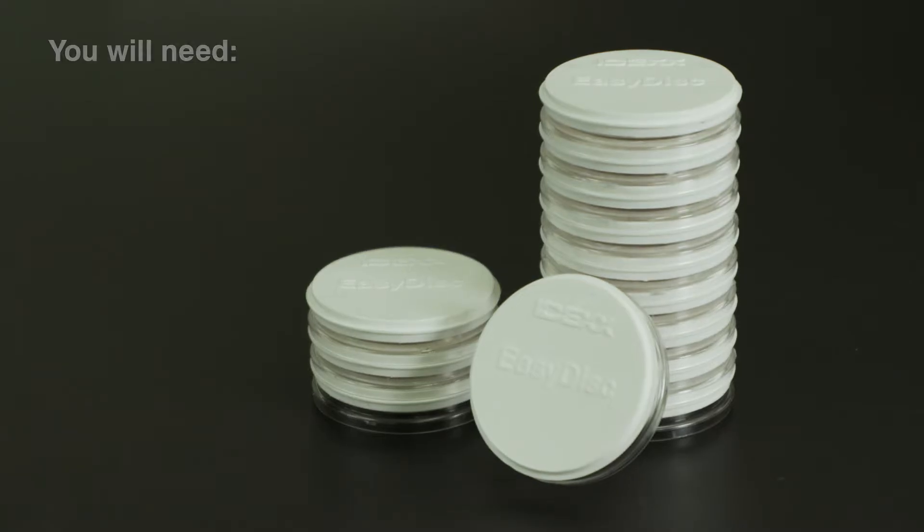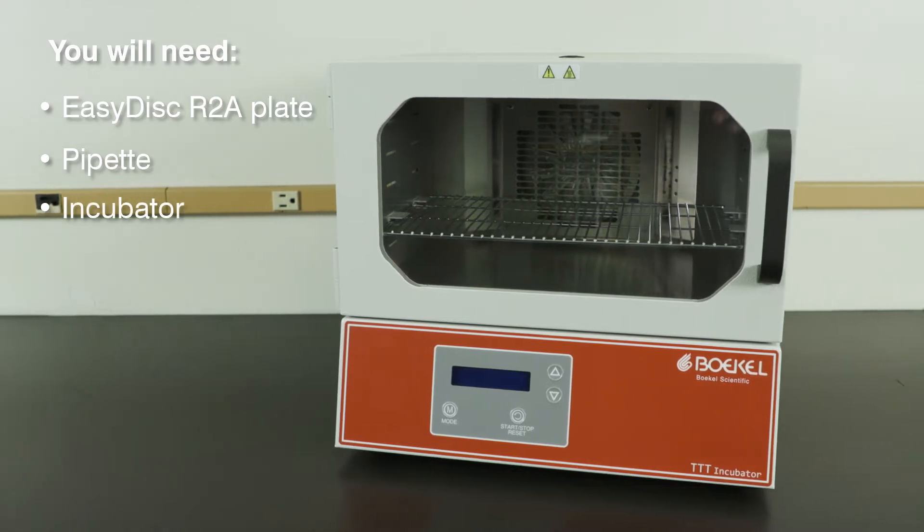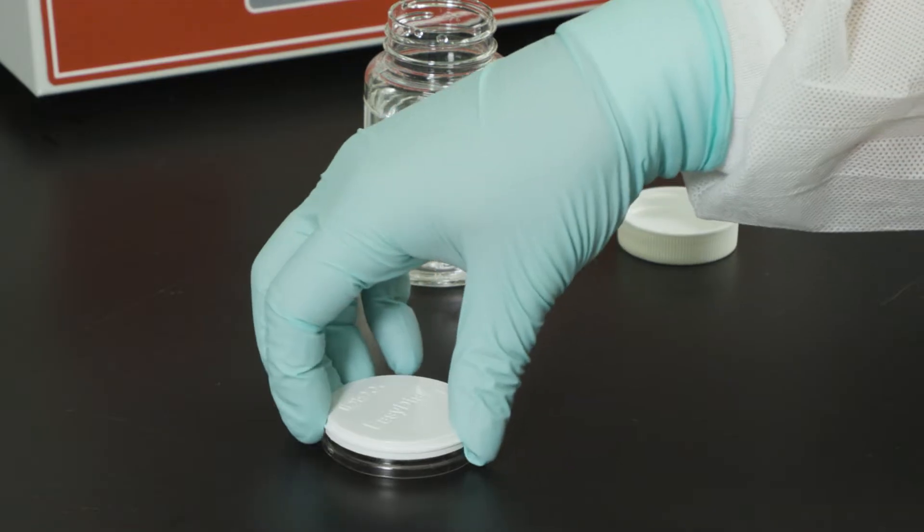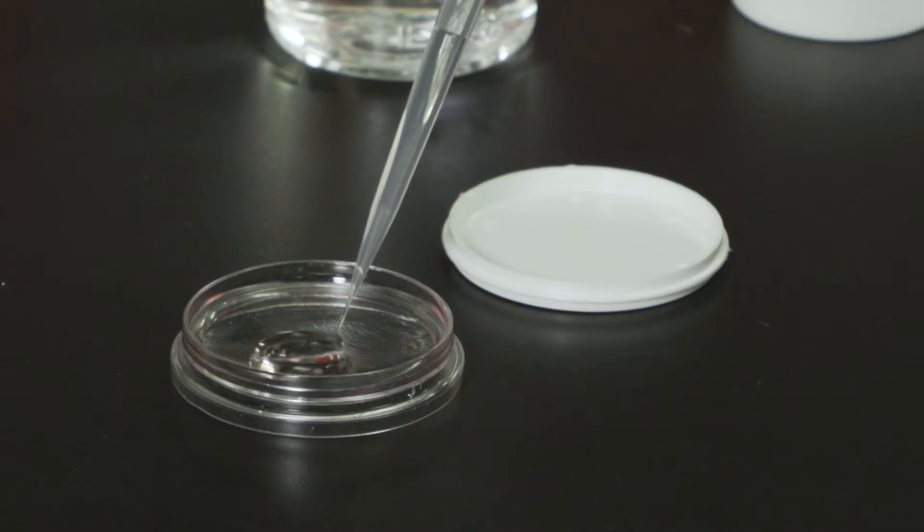For this demonstration, you will need an EasyDisc R2A plate, a pipette, and a temperature-controlled incubator. Remove the lid and add 1 mL of water sample directly to the EasyDisc R2A plate.